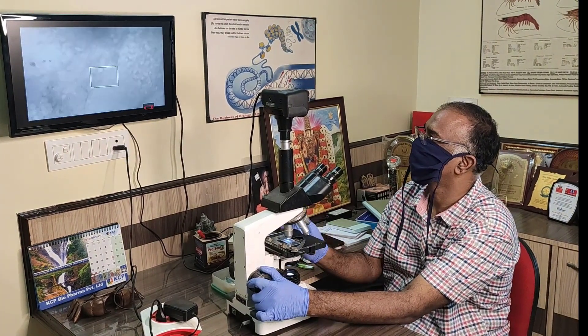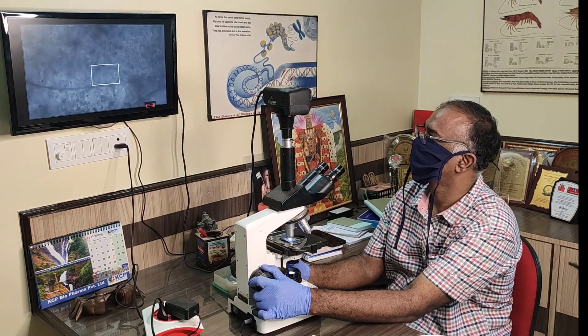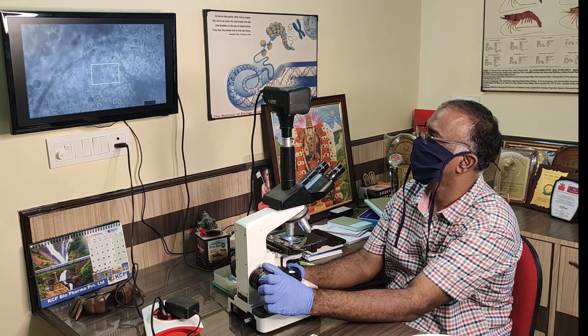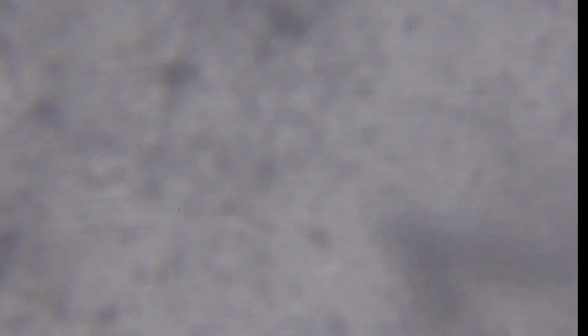Observe the slide under either 40x or 100x oil immersion. I am going to observe only under 40x. This is the video taken at 40x magnification, and now you can see EHP spores.